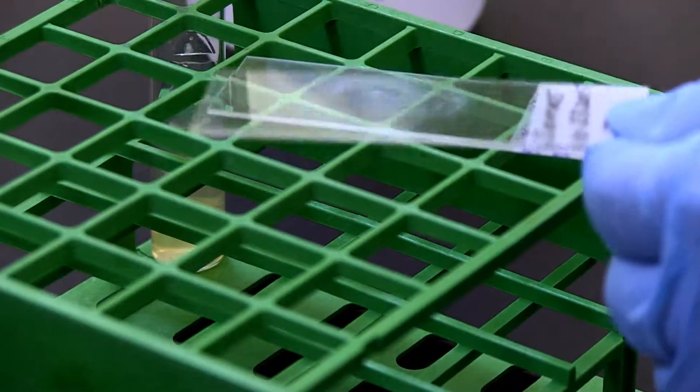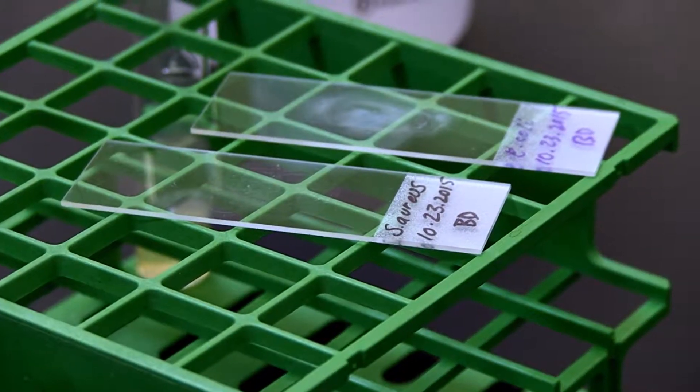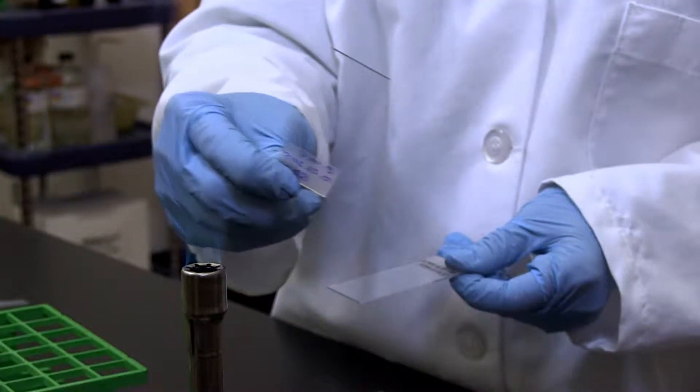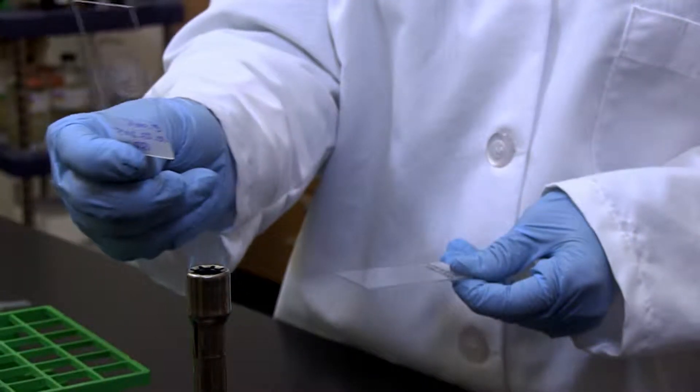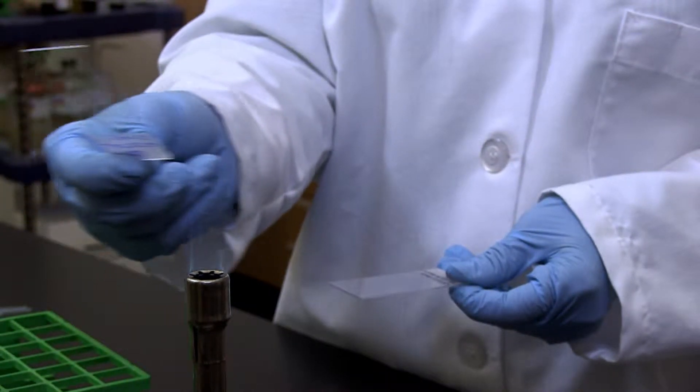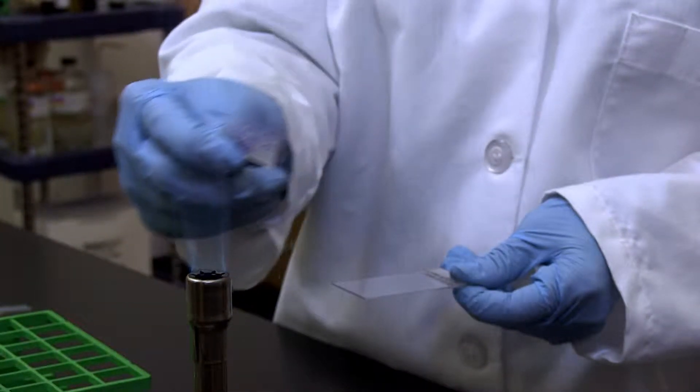Three, allow the smear to air dry completely. This should take 5 to 10 minutes. And four, remember to heat fix the slide. Pass it through the flame of your Bunsen burner three to four times with the smear on top. The slide is now ready to use for staining.